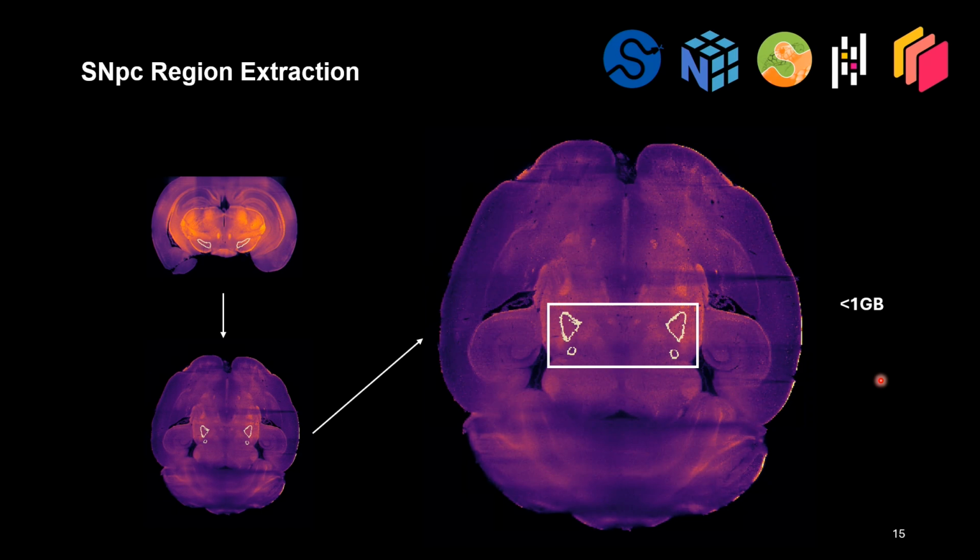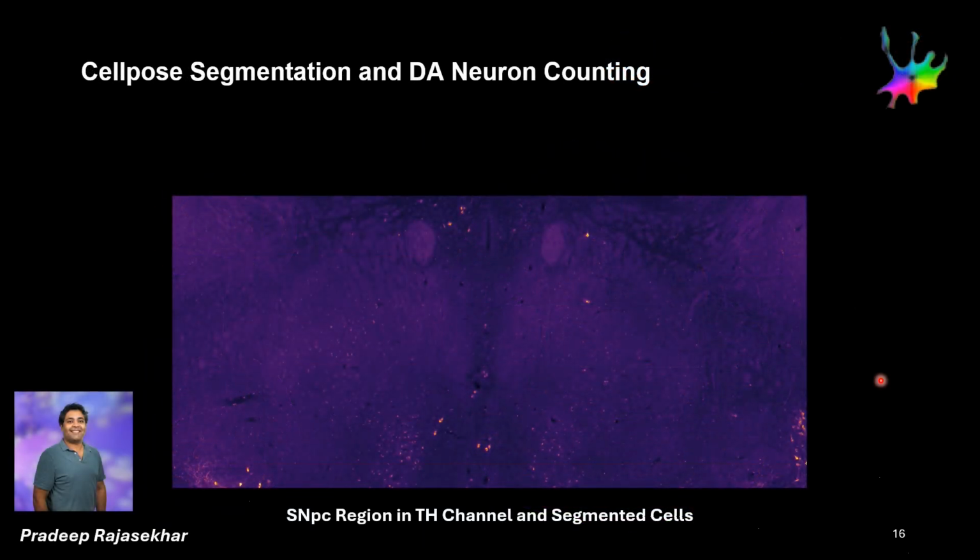And so now that we have this region and we have the full resolution data, we can use Cellpose, which is a deep learning cell segmentation tool.